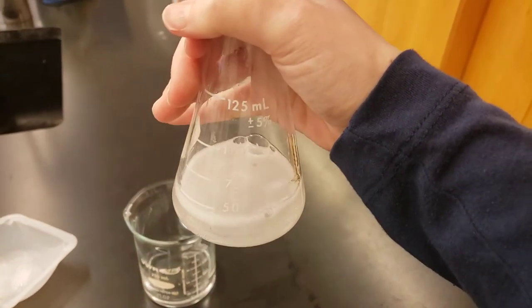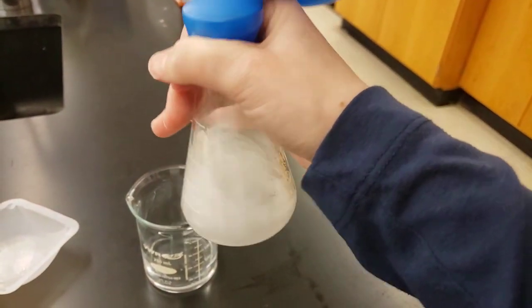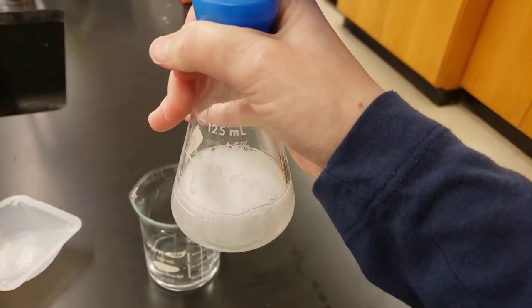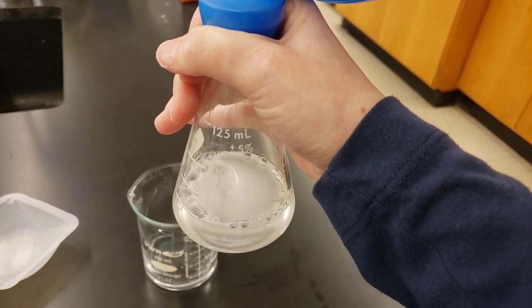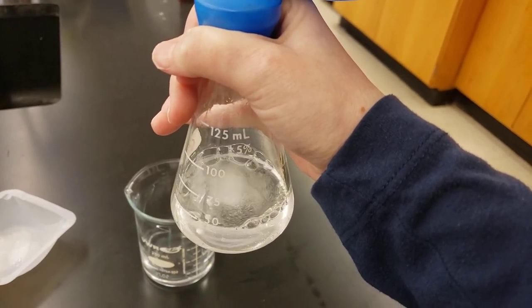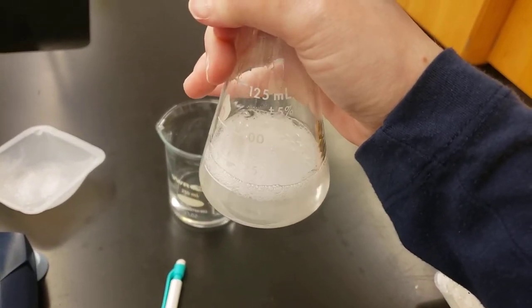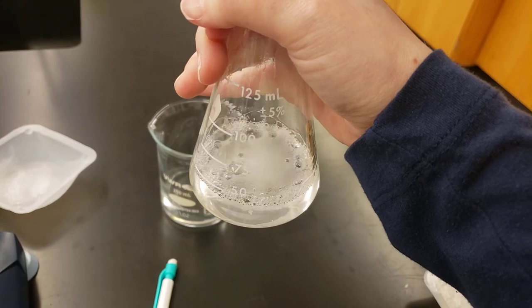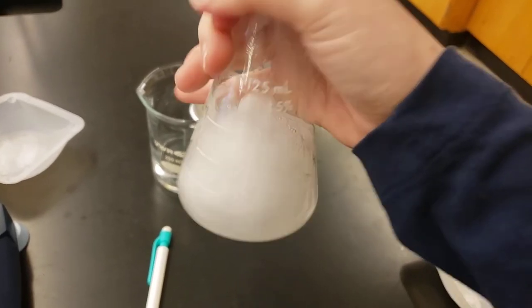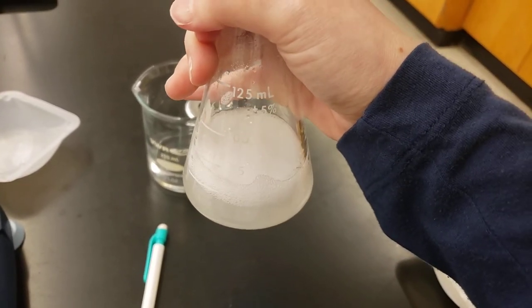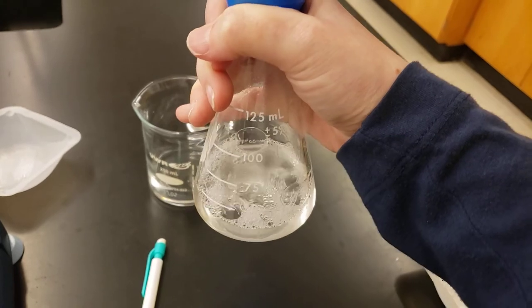Now we want to keep going until all the bubbling has stopped. Give it a few swirls to make sure everything has reacted. We don't want anything from our reaction to remain. Notice how I'm keeping a hold on the balloon the whole time.